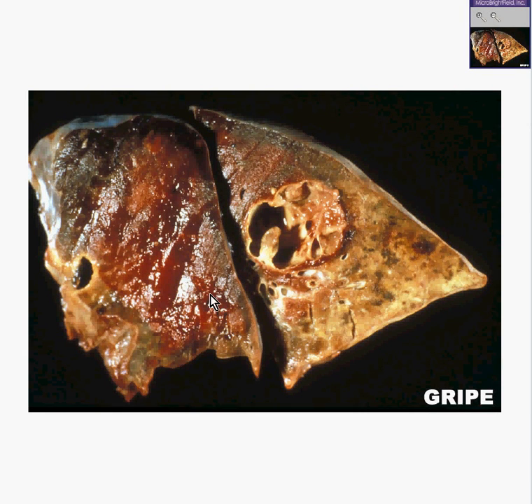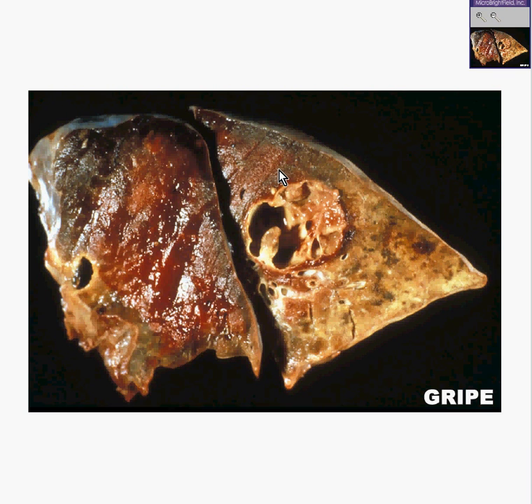Here is a lung. Here is a major fissure between two lobes. Here is a very distinct lesion within one of the lobes. Notice it's well defined and appears to have a semi-liquified and semi-necrotic appearing cut surface. Notice especially that the lung around it appears to look more like liver — more edematous and consolidated rather than air filled. You could appreciate that here and here and here, and if you were to squeeze it with your hand you wouldn't find many air bubbles.